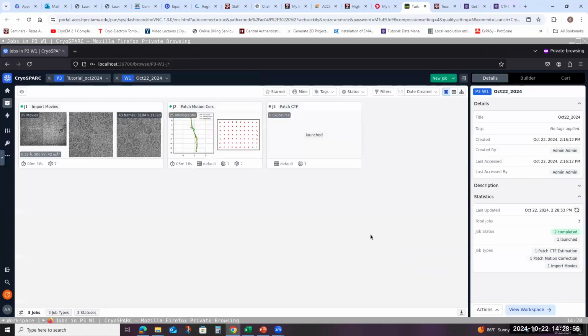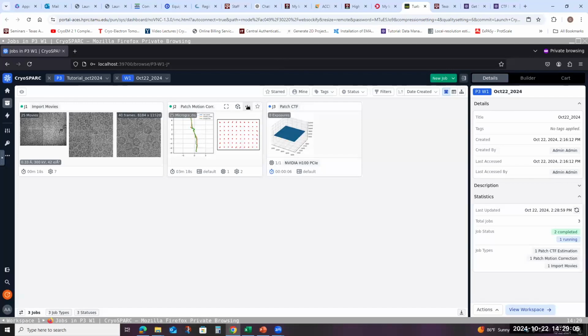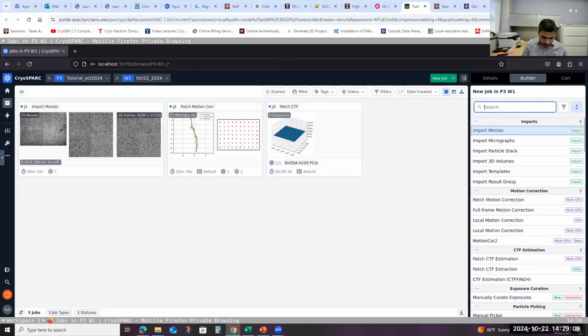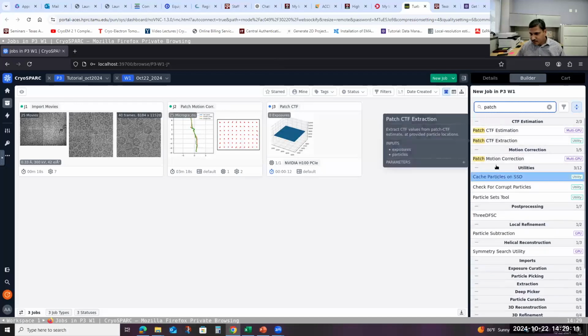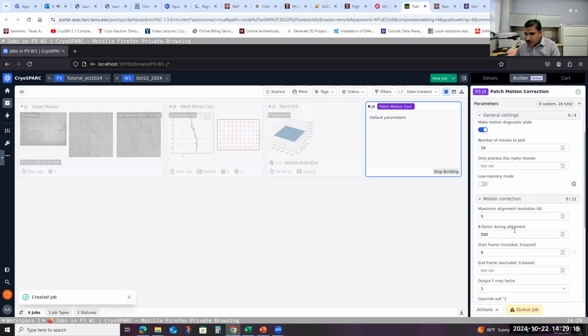We have one question to go over the patch motion correction settings again. Okay.